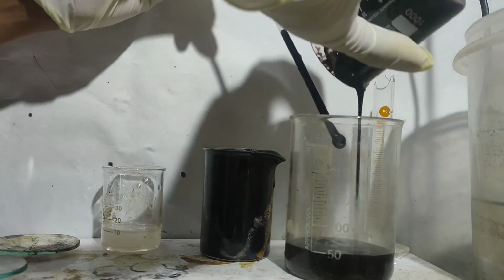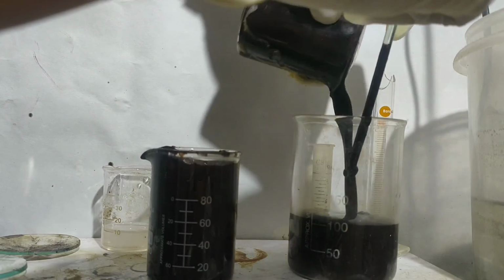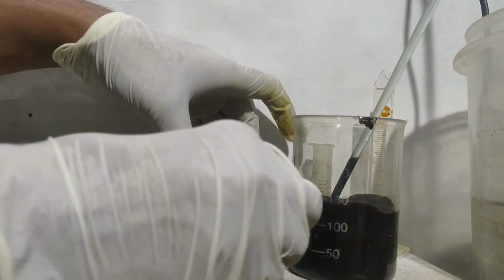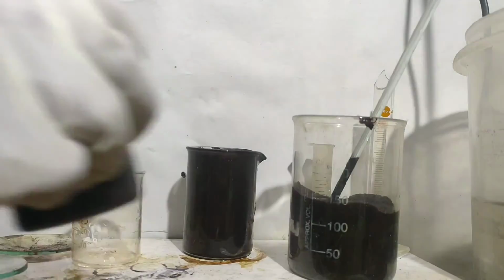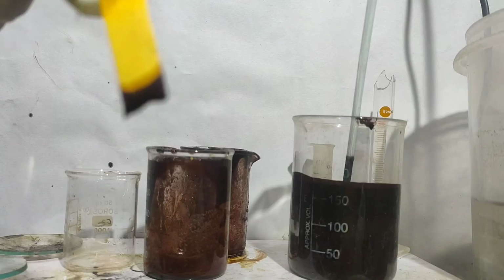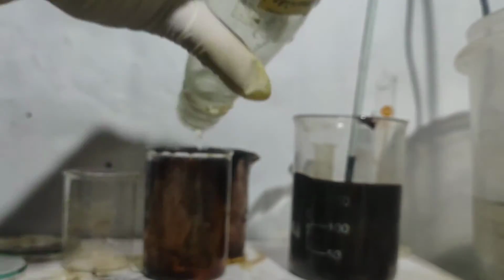I transferred the reaction mixture into a bigger beaker and then rinsed the small beakers with sodium carbonate solution and transferred that into the bigger beaker. I again checked the pH and it was still neutral, so I added some 10% sodium hydroxide solution to make it alkaline and checked the pH.